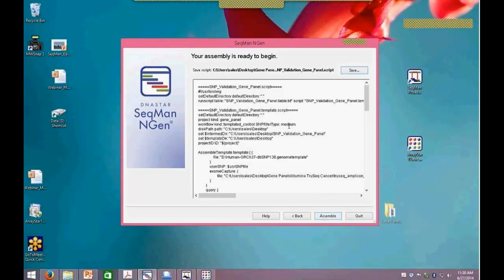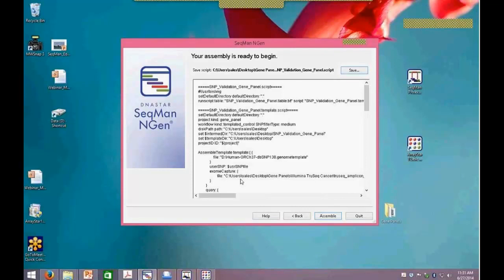When you click Assemble, you can watch the log stream through. If there are any errors, you can send those to us for help. You can also save out the script and the log. When it's done, there will be some options: I can open the project in SeqMan Pro to look at the assembled data and run a SNP report, or if I have multiple samples to compare, I can load them into ArrayStar. We'll also have a validation button — when we click that, it uses the validation control to calculate accuracy measurements across all those SNPs in the validation VCF file.